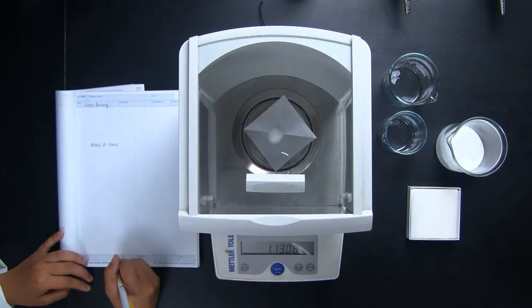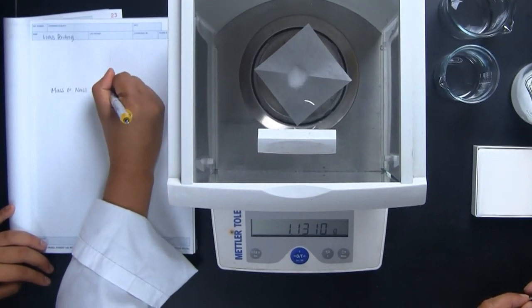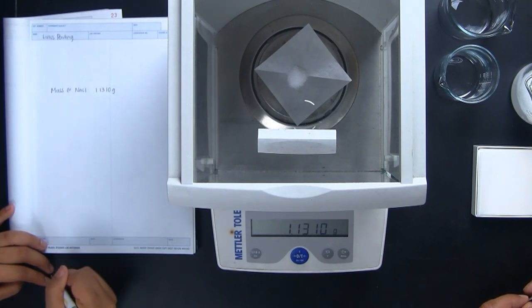Using the tare function, the subtraction is done for you, and the reading on the balance is the mass of the reagent that was transferred to the paper. You're ready to go.